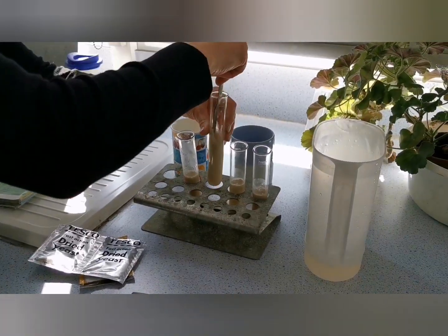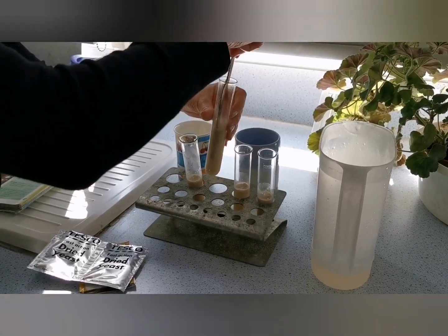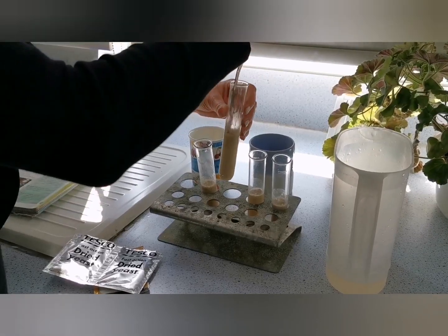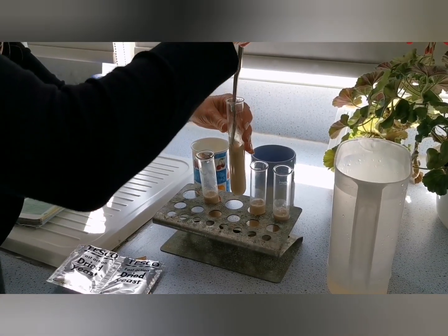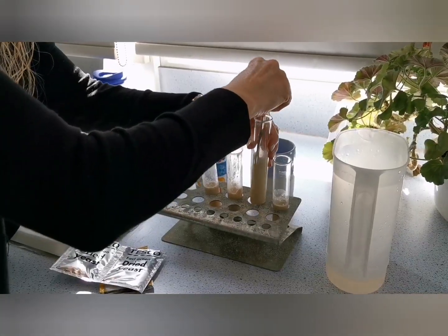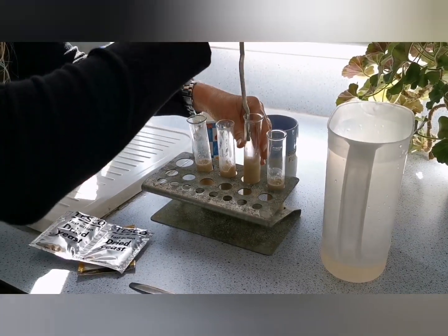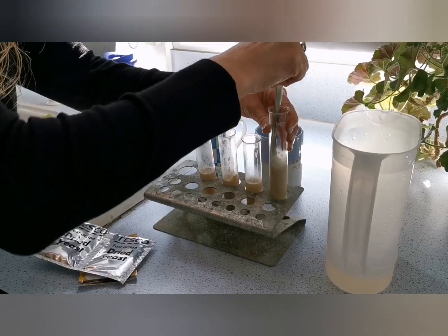I'm then in a minute going to put a balloon on top of each of these to capture the gases. So can you remember what gas we're trying to capture? Have a little think. If you said carbon dioxide, you are correct. Does anyone know the symbols for carbon dioxide? If you said CO2, you'd be correct.